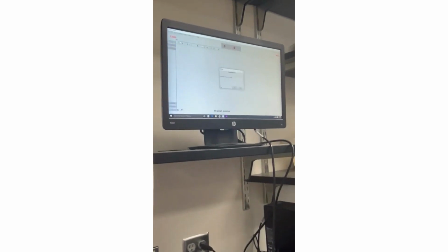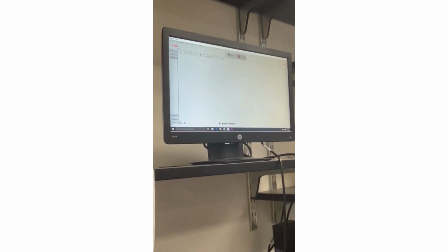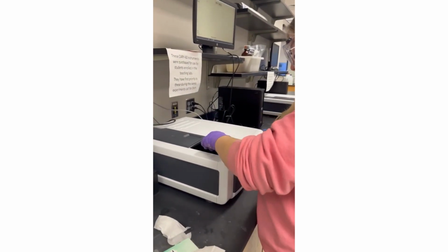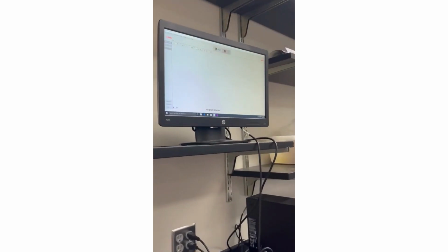Units are in L times mole to the -1 times centimeters to the -1. L is in centimeters and is always assumed to be 1 centimeter, and you solve for C.